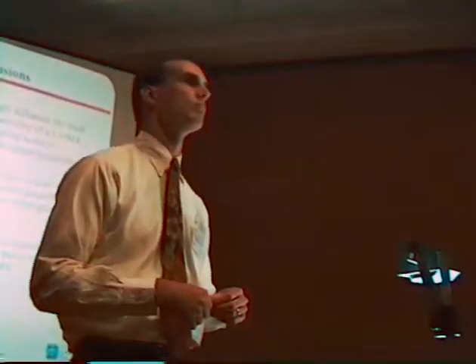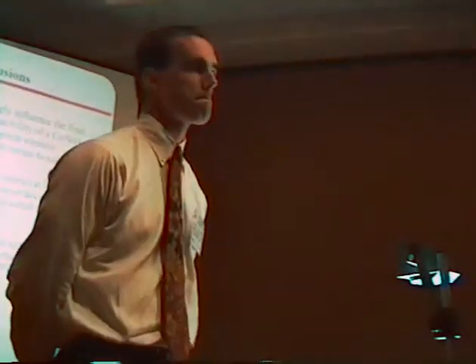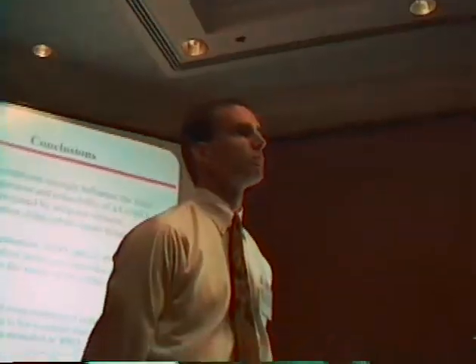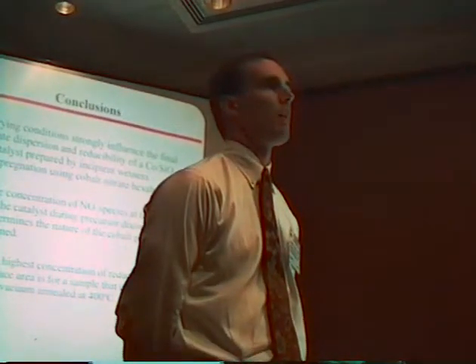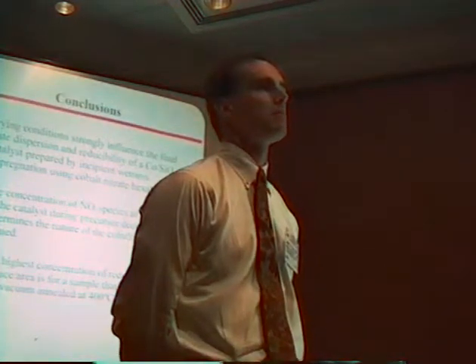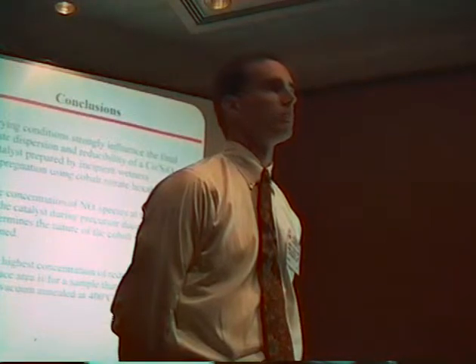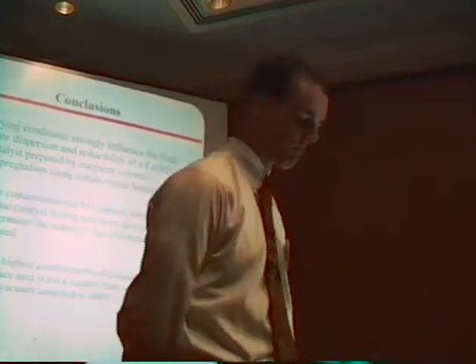I just thought I'd mention that we have prepared an iron catalyst using a triiron precursor and found similar behavior, in the sense that if you expose it to CO and evacuate, there is no residual chemisorbed CO. And I wanted to mention also that it is reported on certain iron crystals that you can get CO chemisorption in a side-on fashion by virtue of essentially using most of your surface dipole.